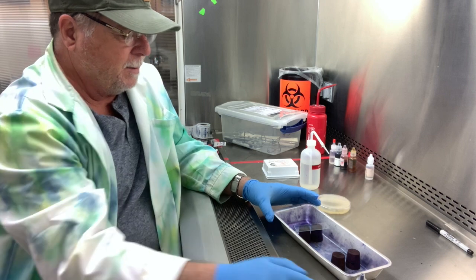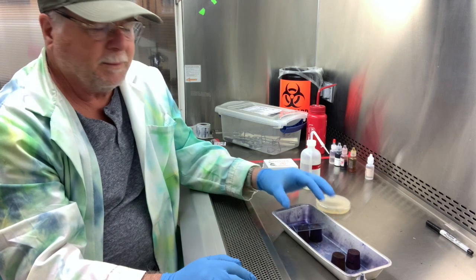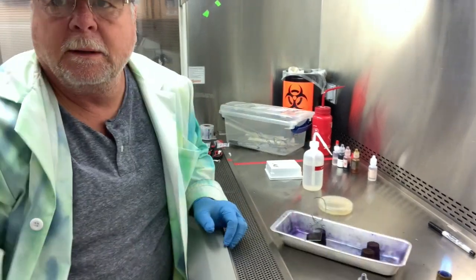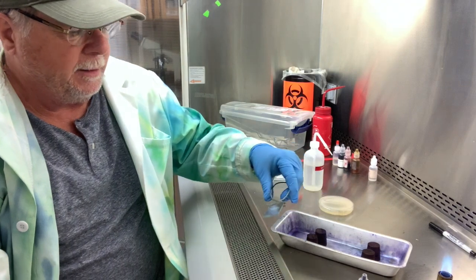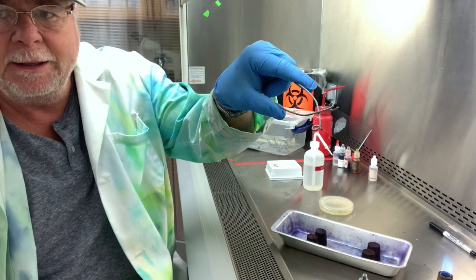All right, so now we have to let this air dry. And that's kind of hard to do. Sometimes we get a little impatient. But I'll come back here in about 2 minutes, and it'll be dry. Okay, I'm back. What I've done is I have now the dried smear. And so it has to air dry.